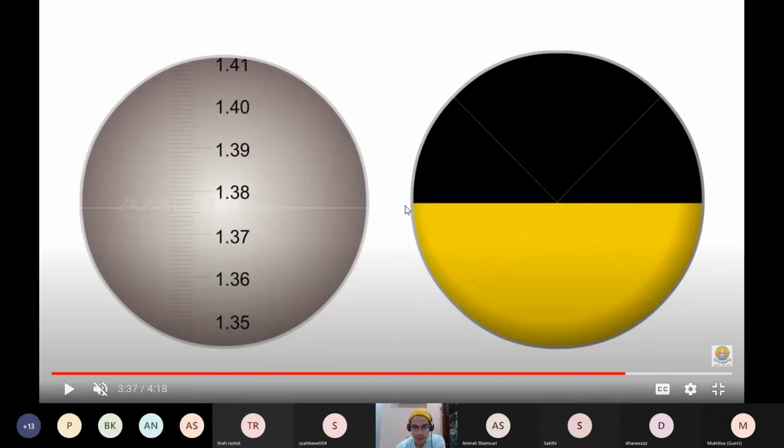Kalau kamu dah adjust this light and shadow evenly, so the reading is 1.376. Yeah, I mean it starts from here, 1.37, 1.371, 1.372, 3, 4, 5 dan 6. So refractive index untuk bahan yang kita test tadi itu adalah 1.376. Okay, dia ambil 3 titik perpuluhan.